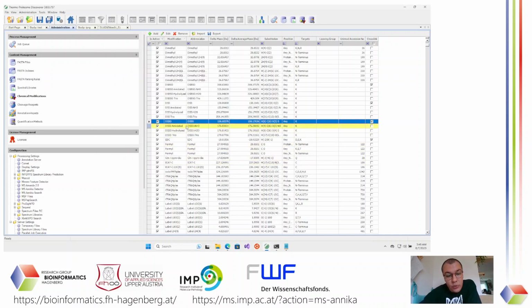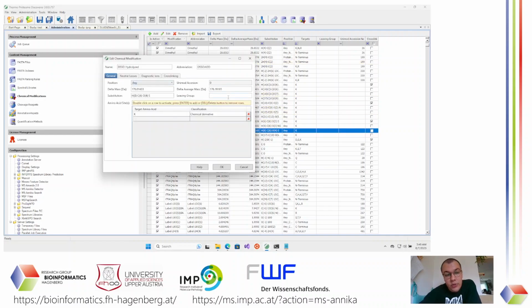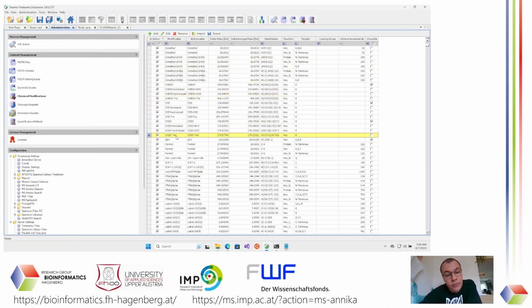What you also should then do is, of course, defining the monolink forms of them. So usually you have an amidated form if it reacts with ammonia, or if it's hydrolyzed, then you should also specify the hydrolyzed form. For these ones, you don't need to specify any cross-linking stuff, because this is only considered for the monolink, which is not important for identifying doublets. And also the Tris buffer form usually is also specified if you have that.